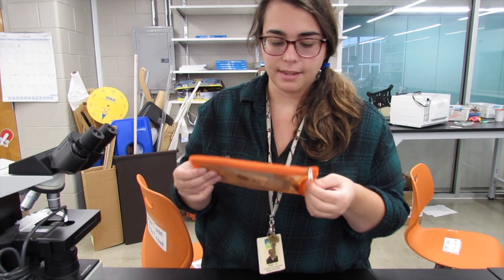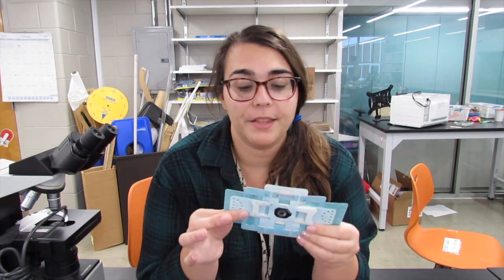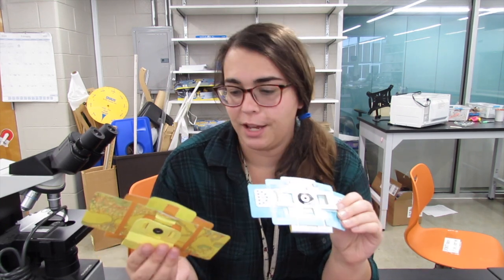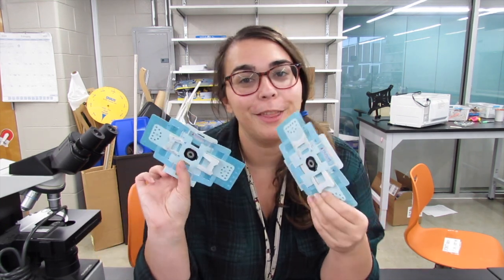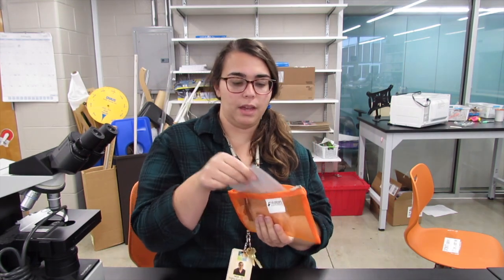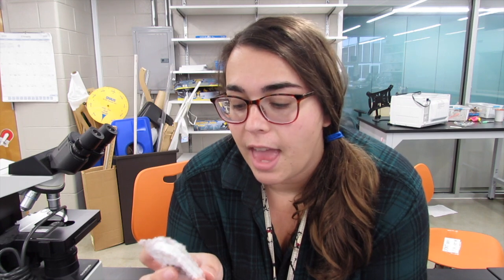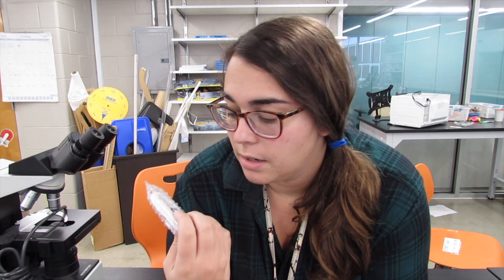Your Foldscope that you're going to get in class is going to be in one of these cases, and in that case you will have a Foldscope that's already been put together for you — that's why yours is going to look a little nicer than the one I put together. Your kit is also going to have a field guide, some stickers that will help you attach the microscope to your phone, a magnifying glass and light, and little tools that can help you collect samples and learn how to use the Foldscope.